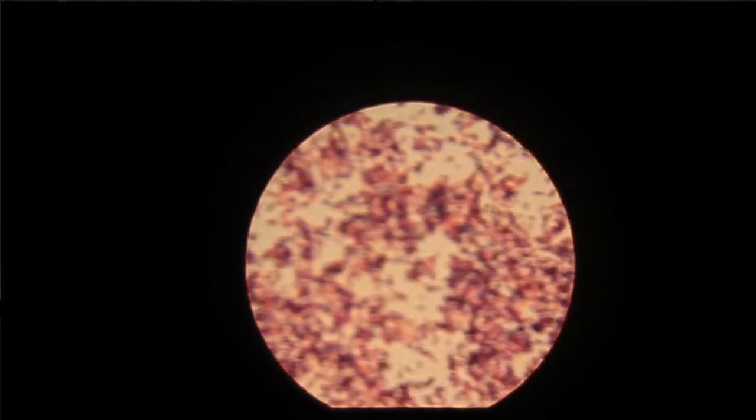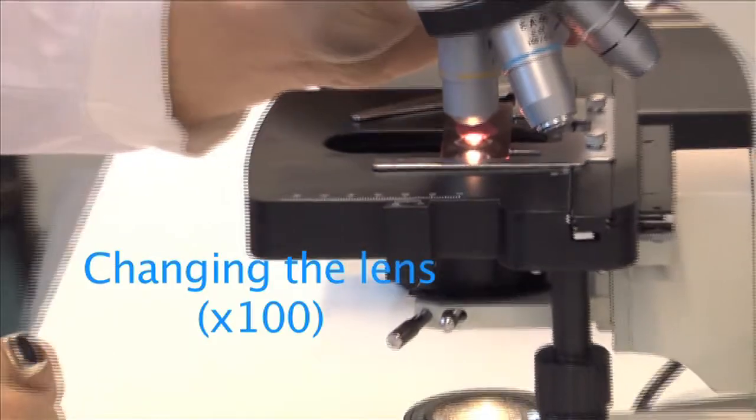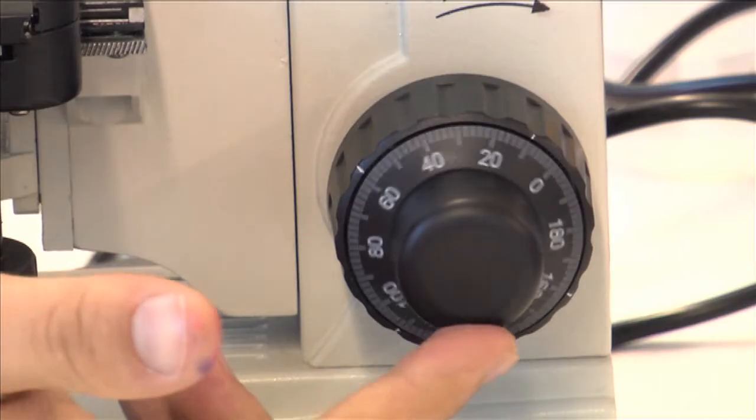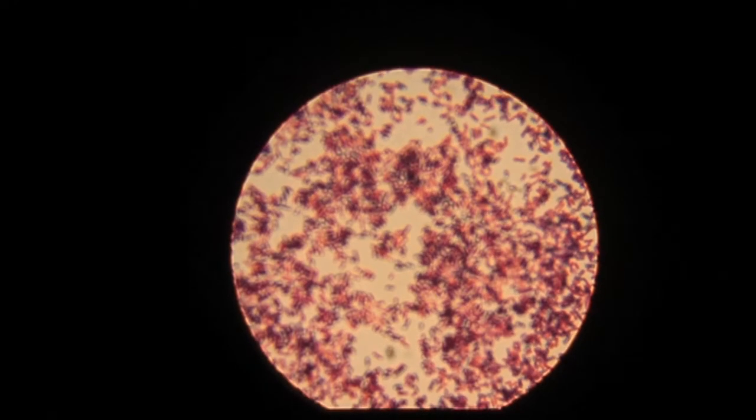Increase the magnification by sliding the next lens along into place. This will be the yellow lens, or the x100. You may need to adjust the fine focus after changing lenses.